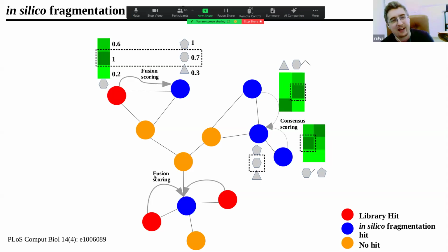We use the cluster where GNPS runs, but we have memory limitations and so on. So we decided to create an application that anyone can run on their own computer, and it's faster and also improves the model, and we can propagate an annotation further than the closest neighbor.